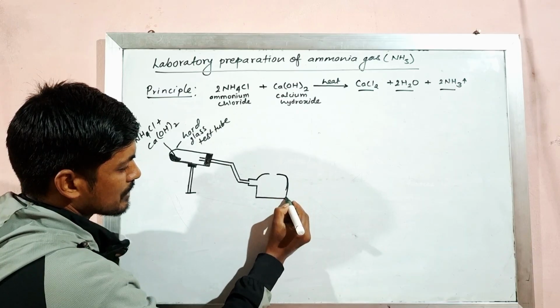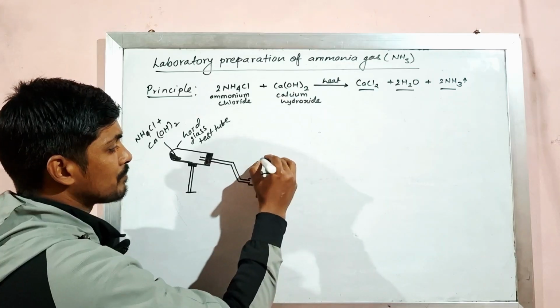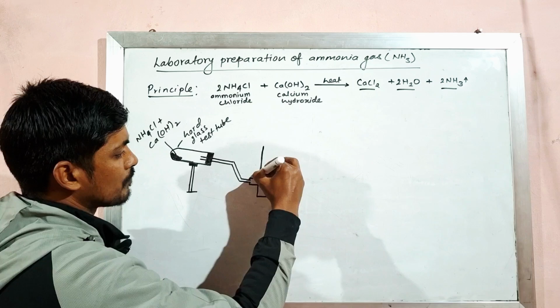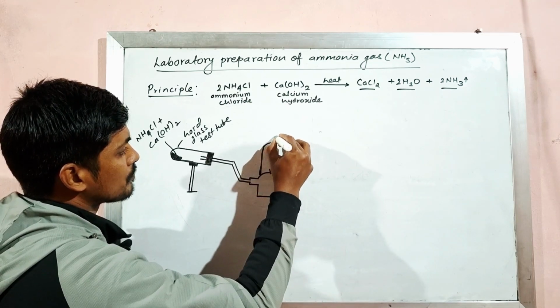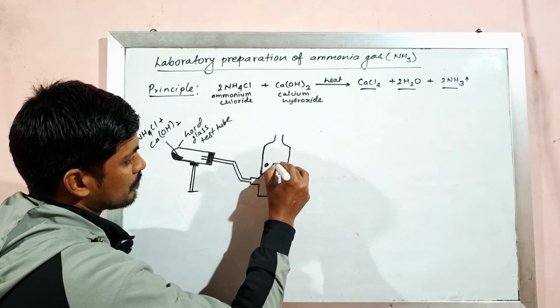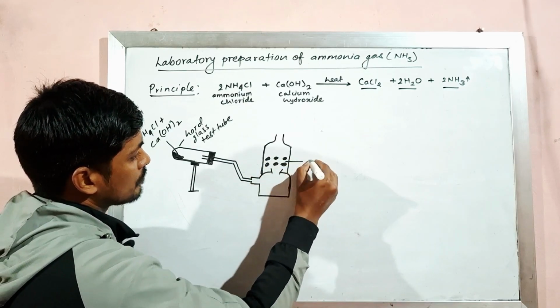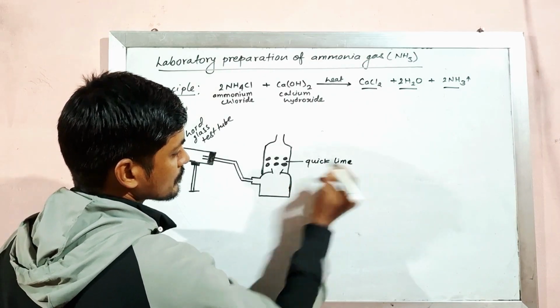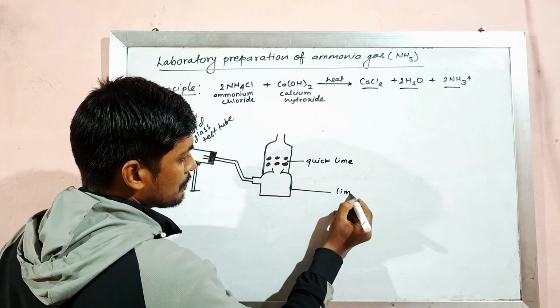And this lime tower actually contains quick lime. In this lime tower, there is quick lime. And since it contains quick lime, it is called lime tower.